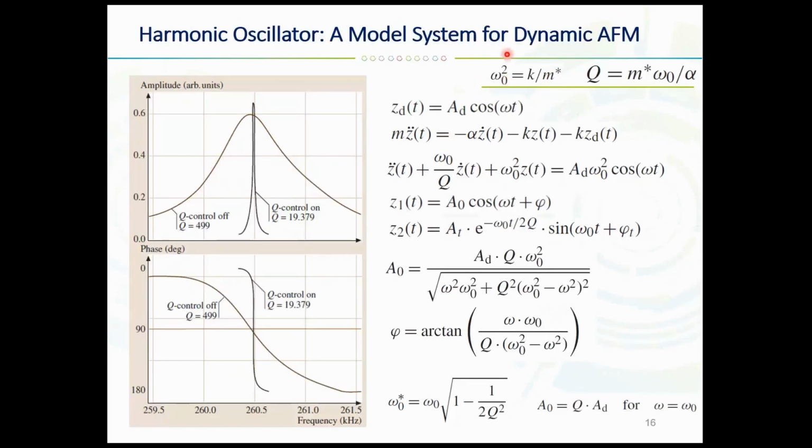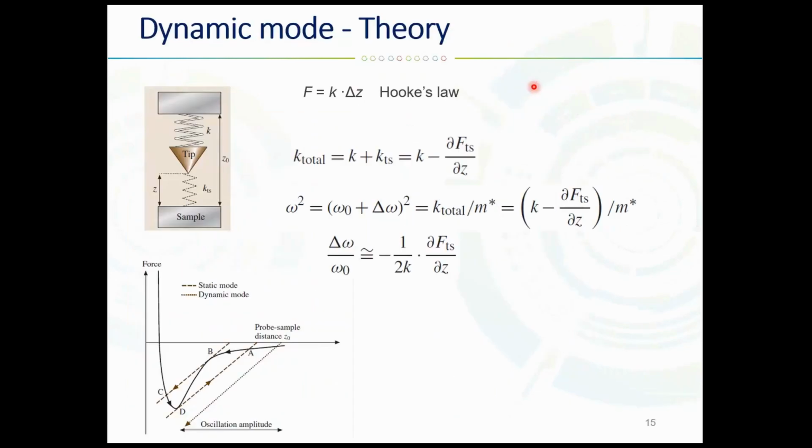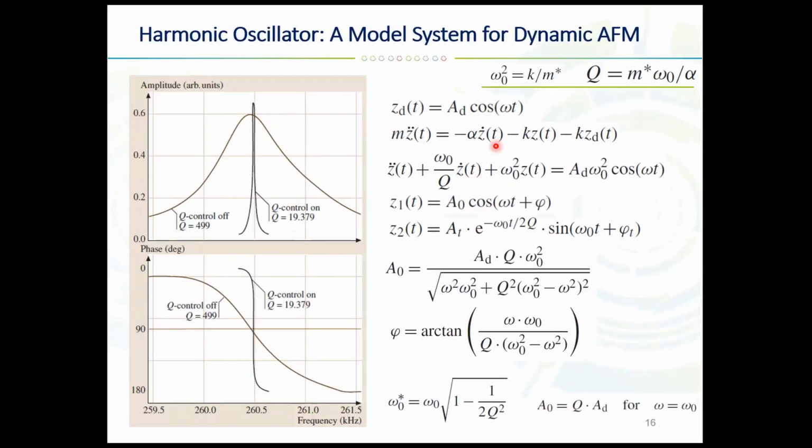So these are just a bit of terminology. We will define our resonant frequency as this, the same equation as here, just to remind you. And we will further define the dimensionless quality factor Q. So this is inversely proportional to the damping coefficient.